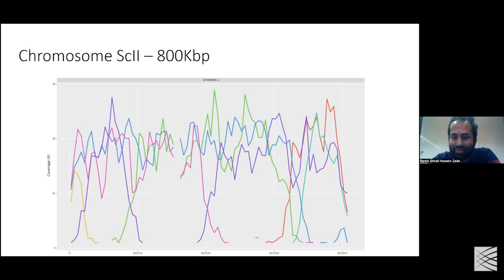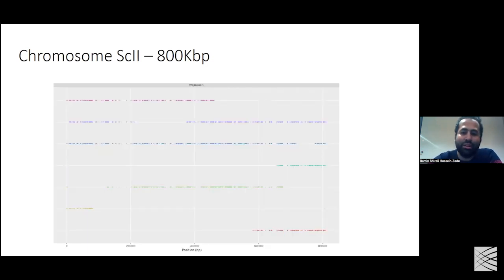And yeah, which ones are the actual haplotypes? And if you look at the other one that tries to line them up, again, same problem. 4 haplotypes here, 4 haplotypes here, even more here. What should we do with the extra sequences? I don't know, and that's the problem. That's the problem that I have with nPhase.